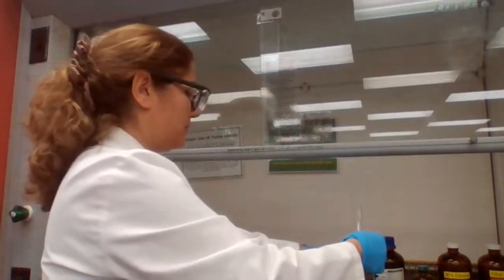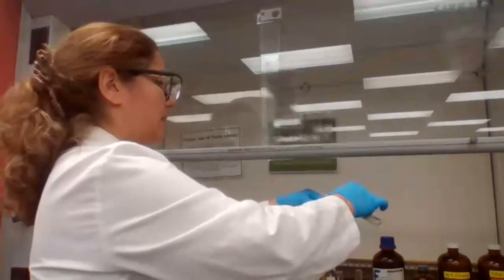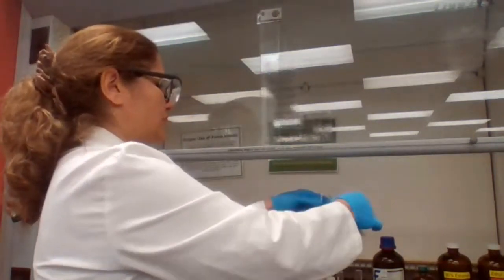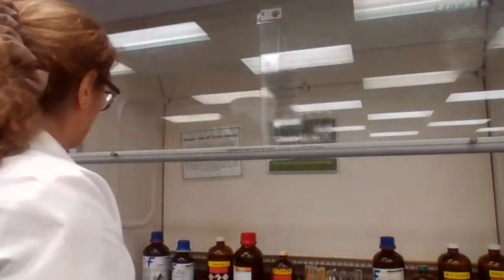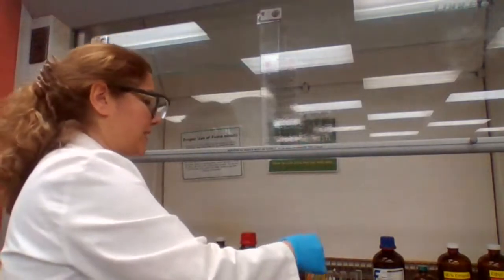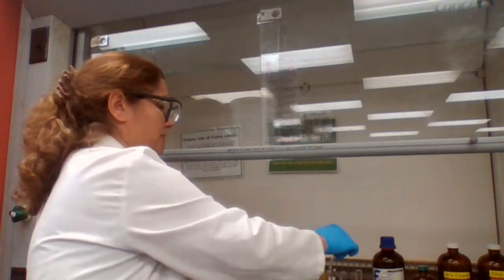I have my Tollens reagent ready in 3 separate test tubes. To the first one, I'm adding cyclohexanone. How much cyclohexanone should I add? How much of the aldehyde or ketone should I add? How many drops?